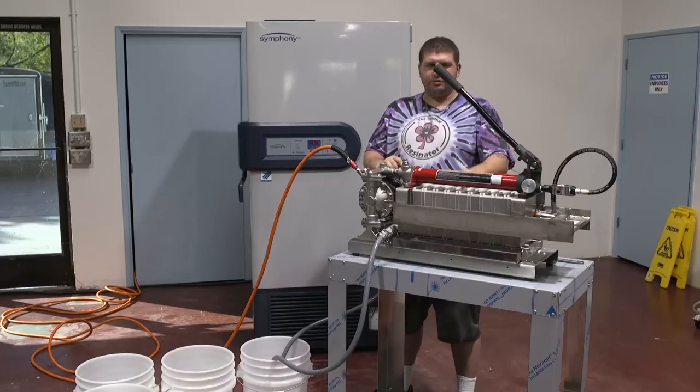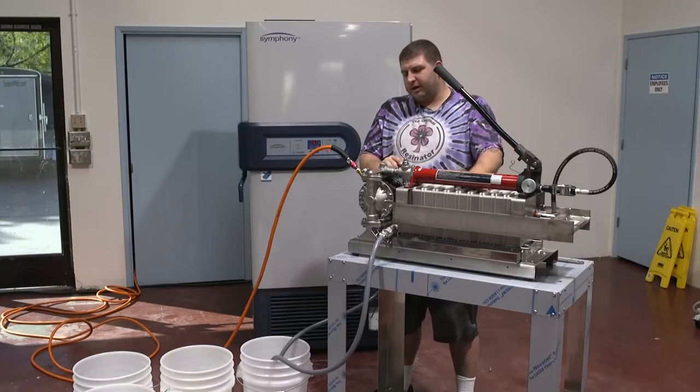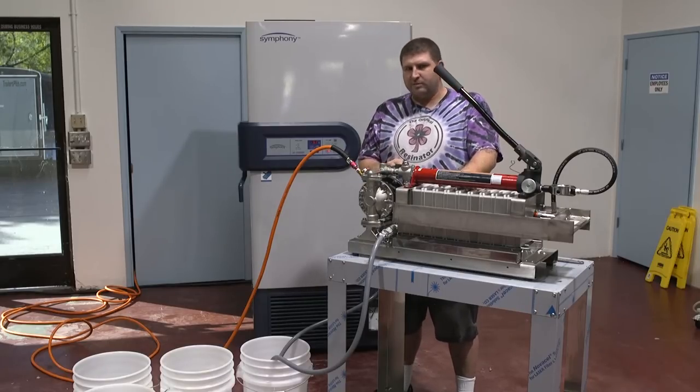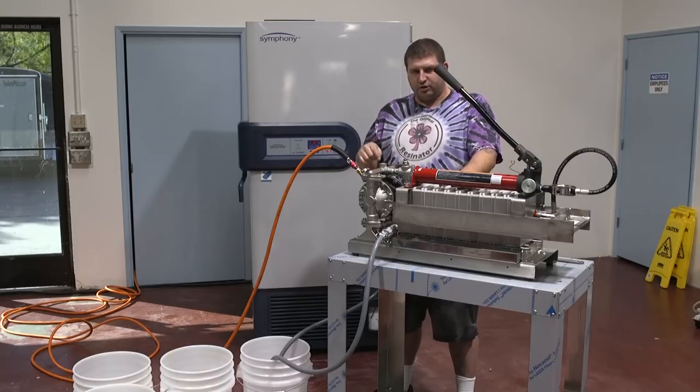We have a stage 2 loaded in here — it's about 8 microns. We ran about 8 microns and we're going to start taking the first bucket of cold alcohol, fill it into the system, and run it through until it chills the system out. We may need to use two buckets because it's a little bit warm today, but then we're going to drain that out and go straight to winterization.